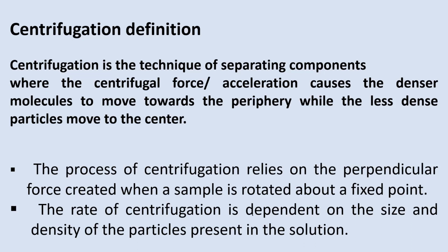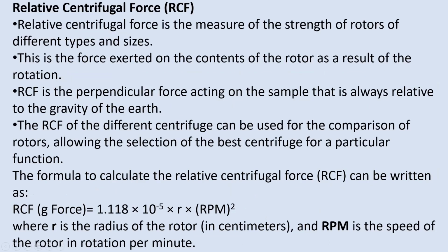The rate of centrifugation is dependent on the size and the density of the particles present in the solution. There is a term that we use, which is called relative centrifugal force, or RCF. Now, what is RCF? It is a measure of the strength of rotors of different types and sizes.